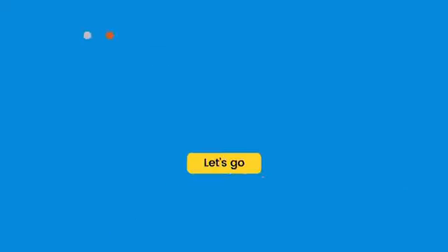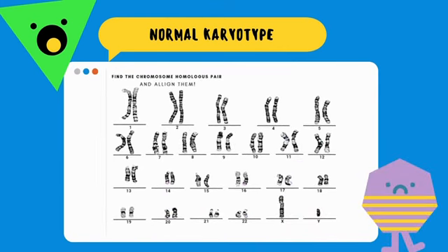So you guys must be wondering, what is meant by karyotyping? Karyotype is the normal nomenclature used to describe the normal or abnormal, constitutional or acquired chromosomal complement of an individual, tissue or cell line. As you can see, this picture shows normal chromosomes arranged on a karyotype of a man. All chromosomes were arranged and aligned in pairs numbered 1 through 22 from largest to smallest. This arrangement helps scientists quickly identify chromosomal alterations that may occur in a genetic disorder.